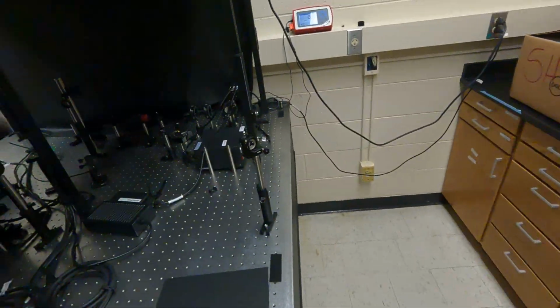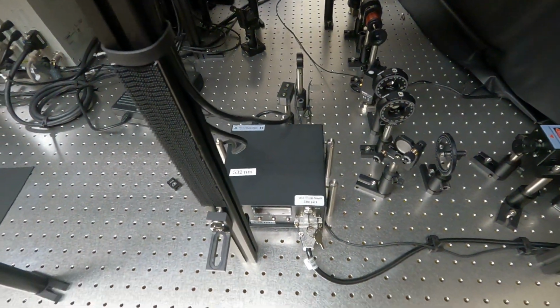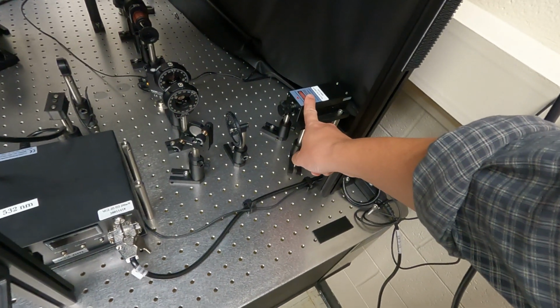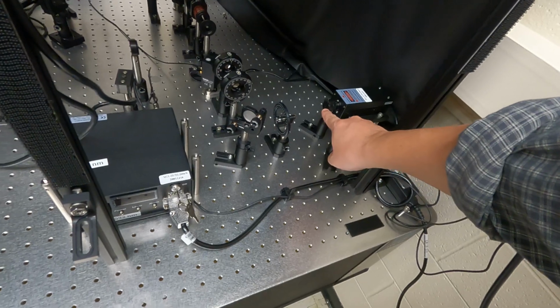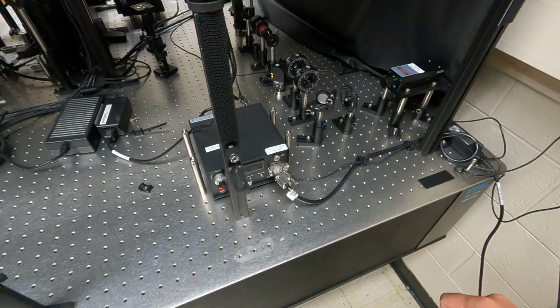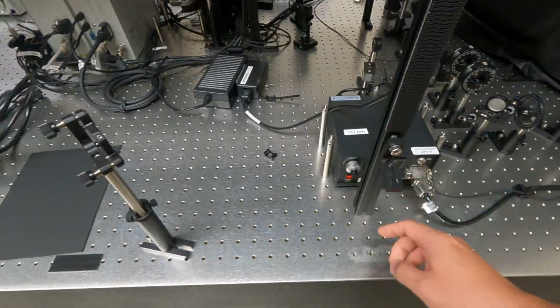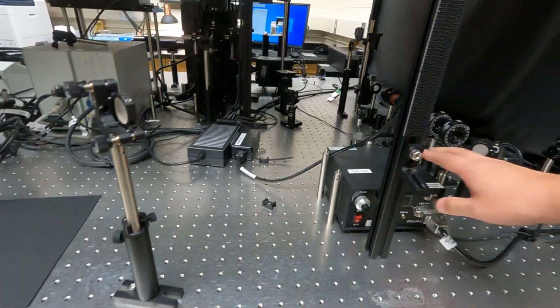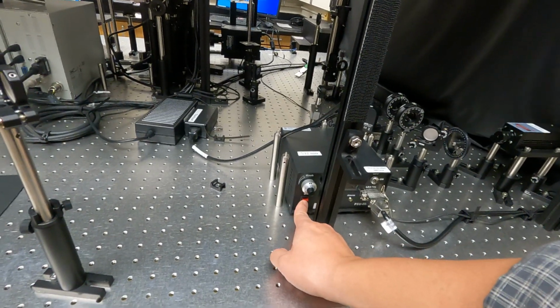The laser we're currently using is a 532 nanometer continuous laser. The actual laser unit is mounted here, and the laser beam comes out from this little hole. However, to turn it on, we actually need to turn on the power supply first, which is located at the lower left corner of this little box. The very first thing you want to do is press this button.